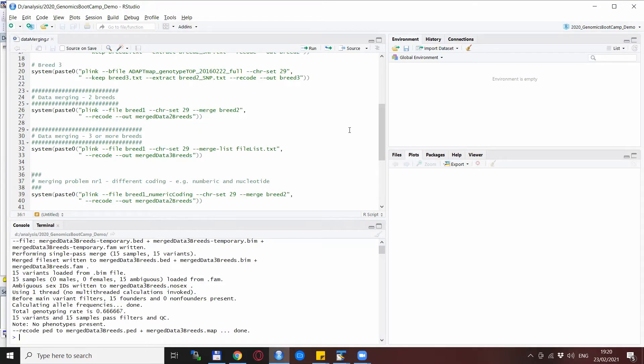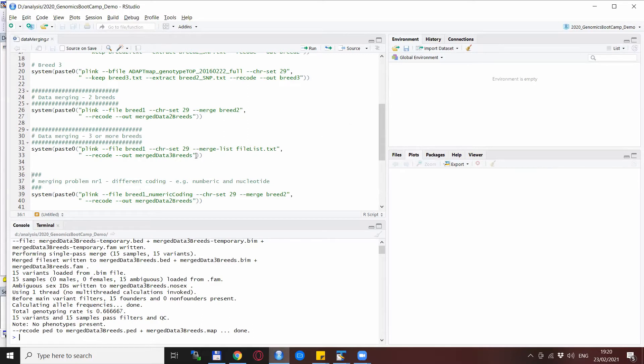And at the end I want to show you a few possible problems you might encounter during the merging process. This first one is a fairly obvious one when you try to merge numeric coding and nucleotide coding data. So let's see what happens.